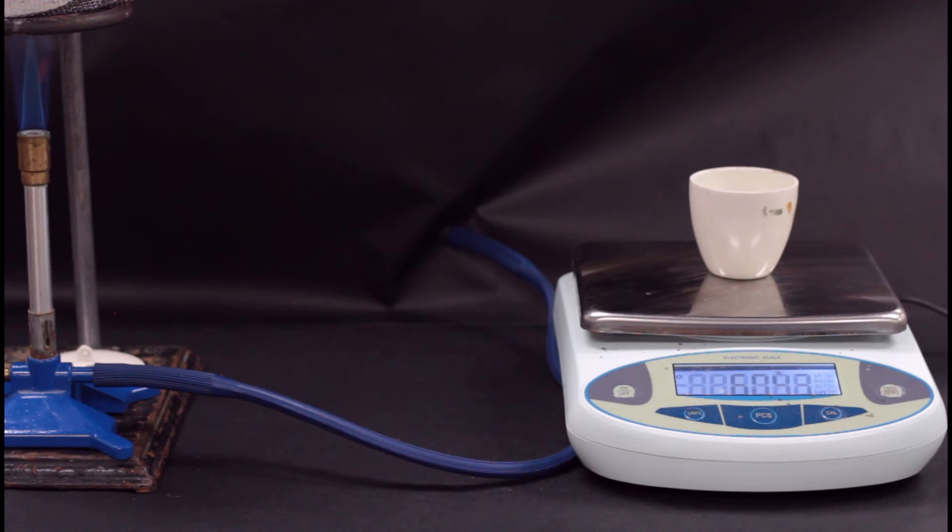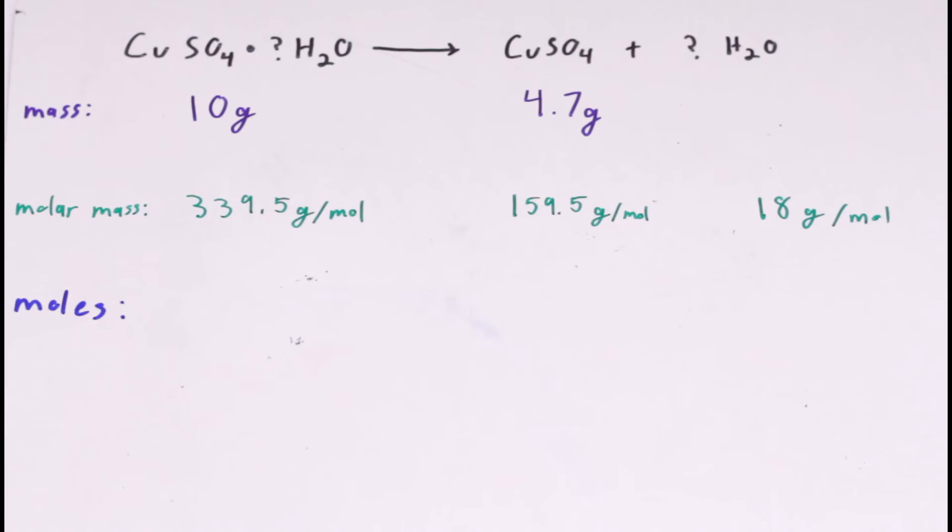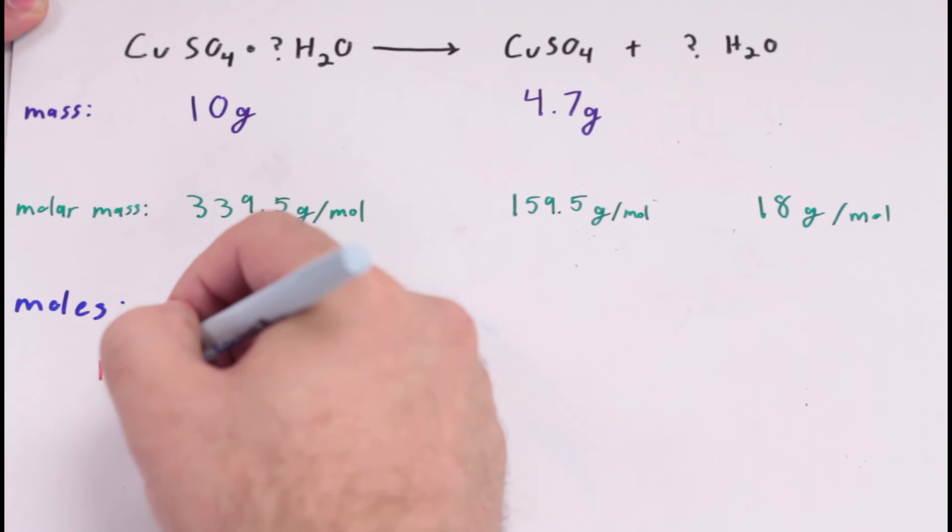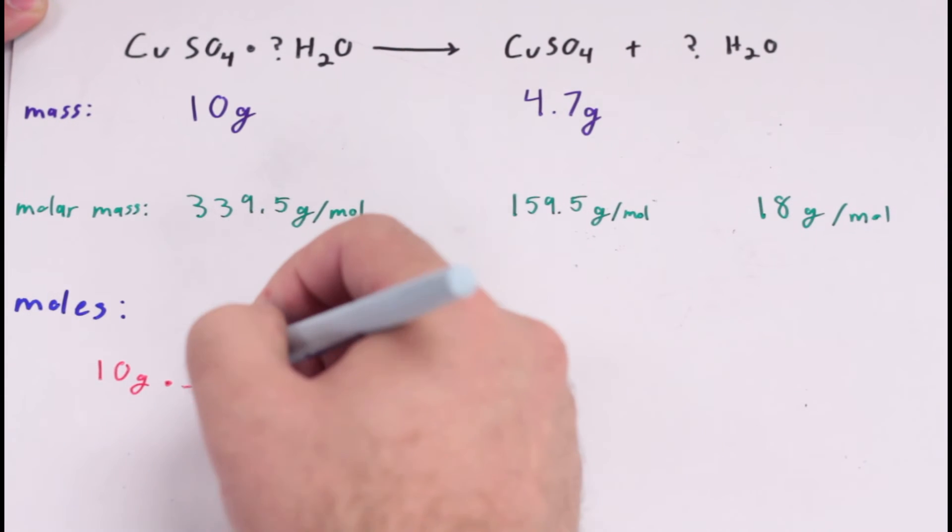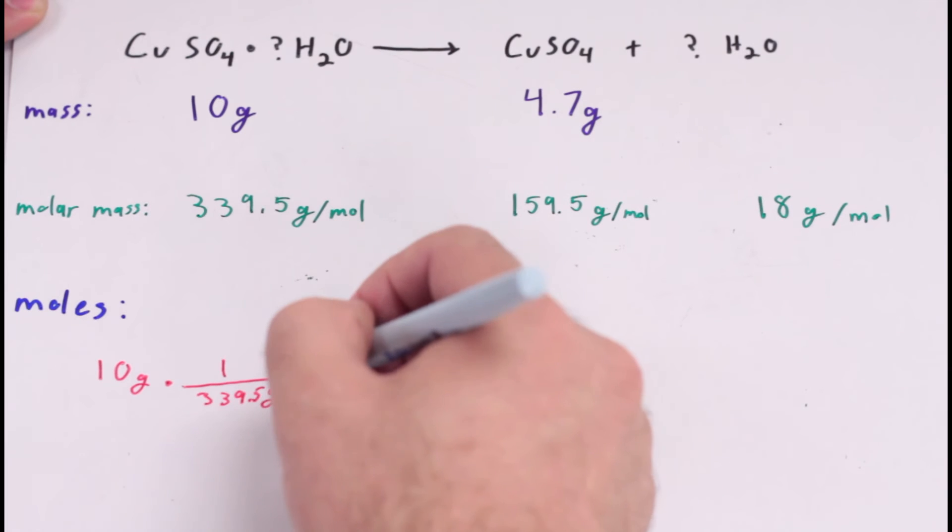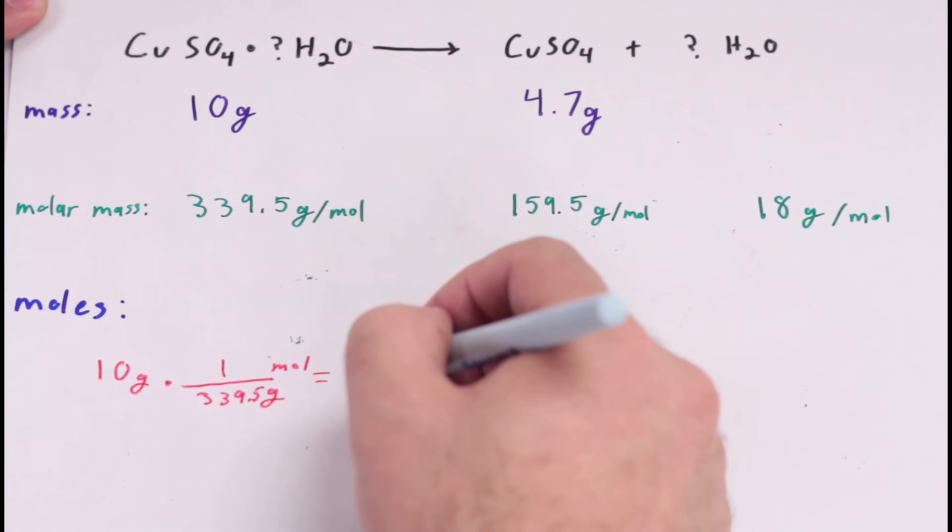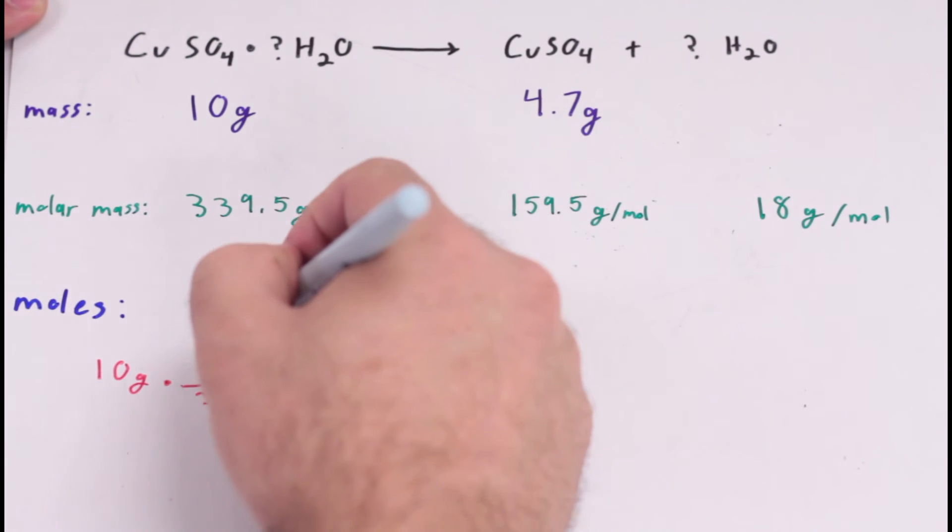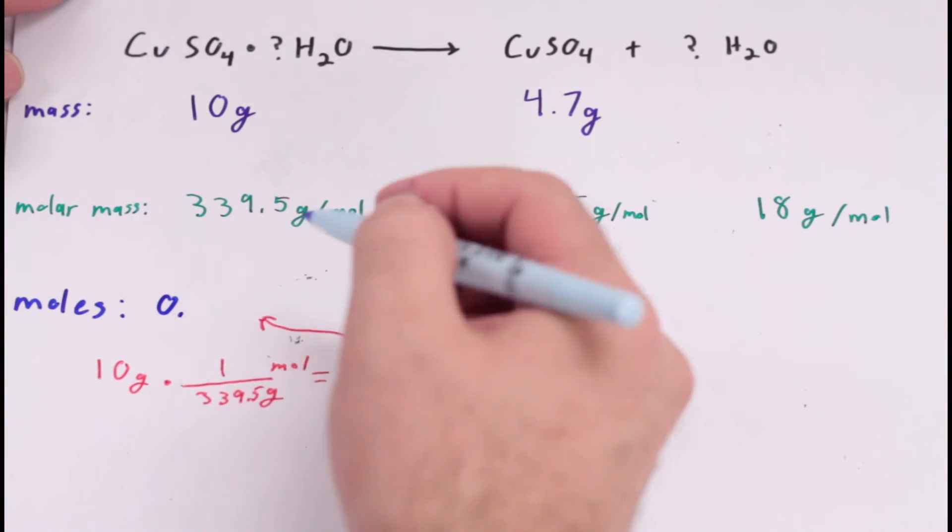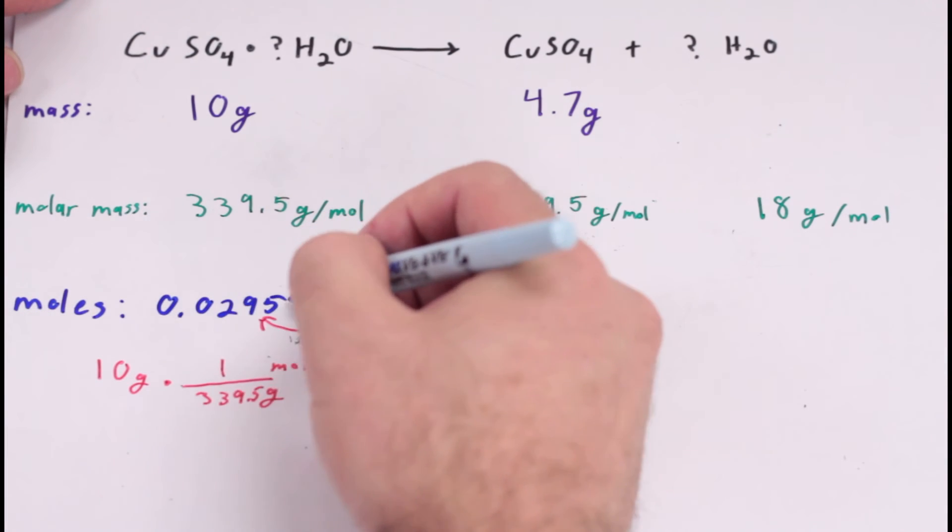Write down your final mass, then subtract the weight of your crucible. This is the mass of your copper sulfate now that all of the water has been removed. Notice the color change. Next, subtract this final mass from the initial mass of your copper sulfate. The difference will be the mass of the water that left.